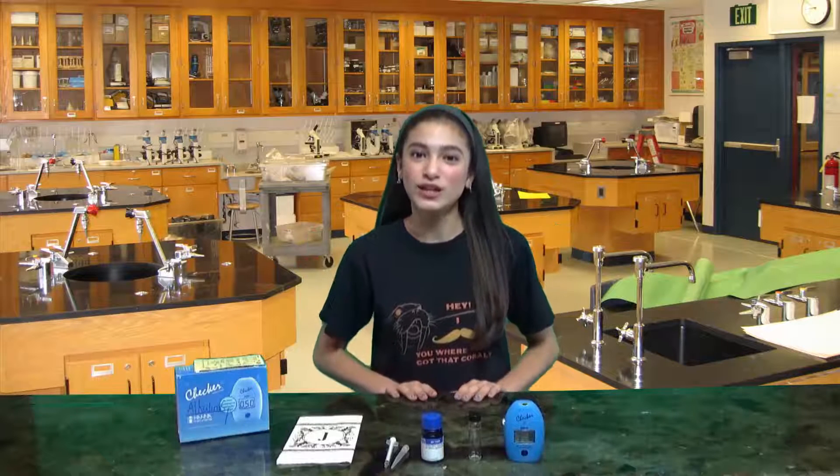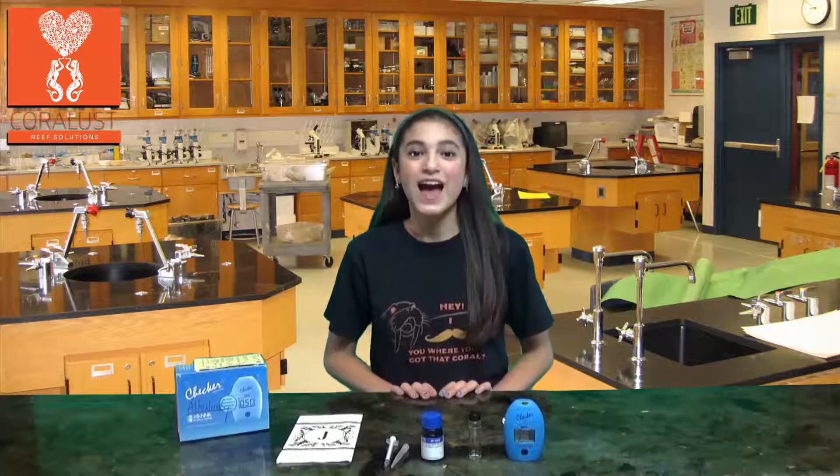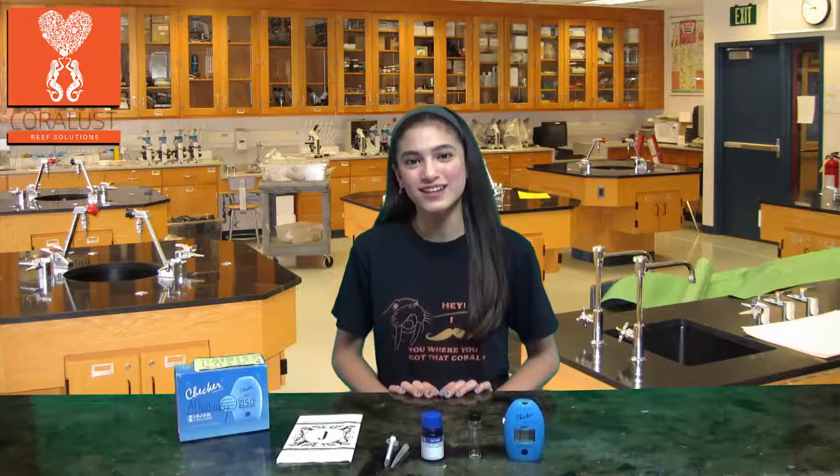Hey guys, my name is Pauline Jodry from Coralust Reef Solutions. I'm going to show you guys how to use the Hanna Checker to test for alkalinity in your tank.